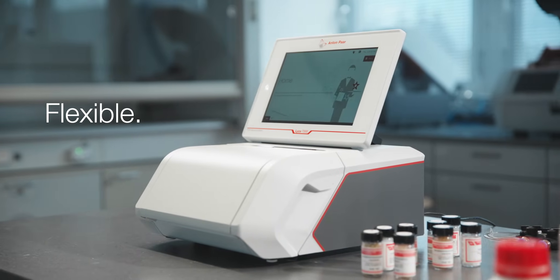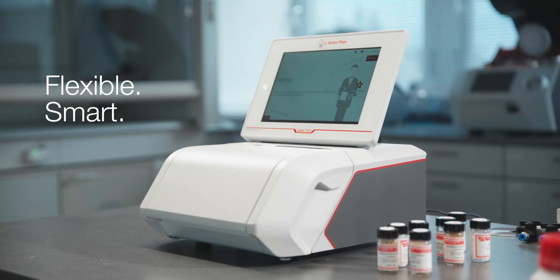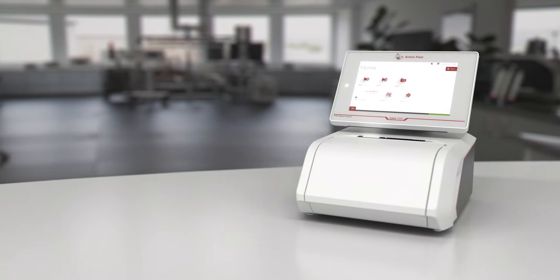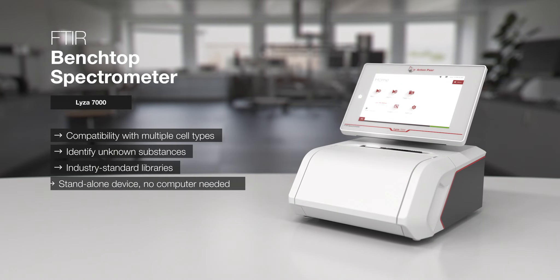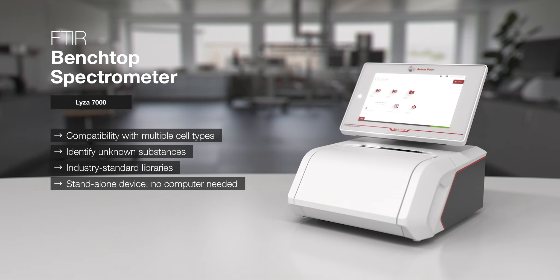Flexible, smart, user-friendly — Liza 7000. One instrument, a world of samples.